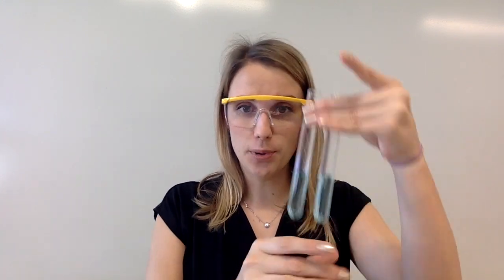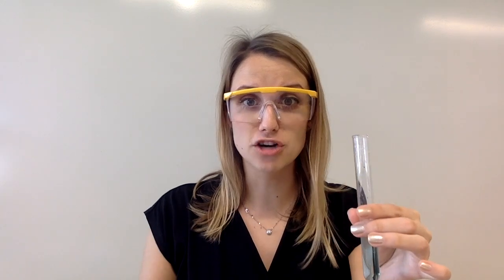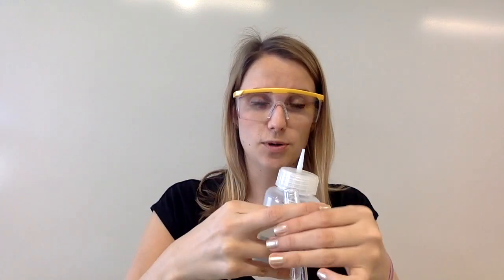So I've got two samples of copper two plus ions. The first one I'm going to test with sodium hydroxide solution. So let's watch what happens here.